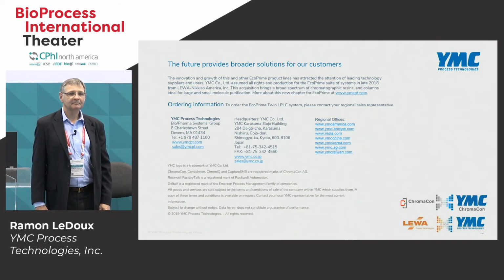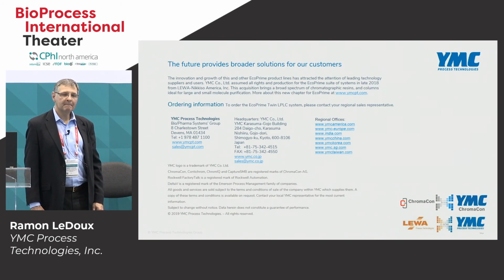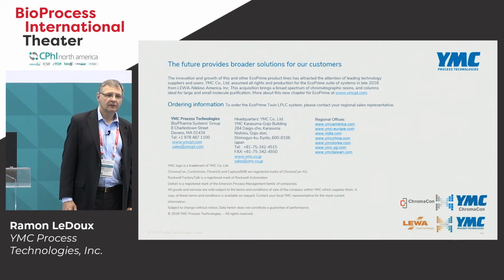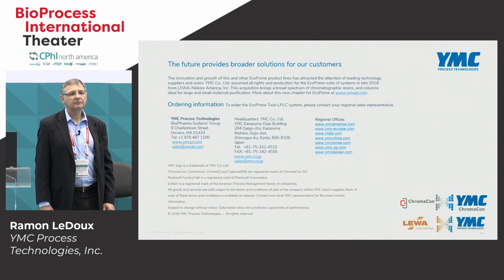Something that popped out from your presentation was the continuous capture chromatography technologies, and something you pointed out helps diminish some of that high cost of the protein A resin. I think you said $14,000 per litre. It's obviously a huge part of the cost of goods. From the other side of the seesaw, rather than looking at technology like continuous capture chromatography, has industry looked at alternatives to protein A, or is protein A really still the gold standard for monoclonal antibody capture?